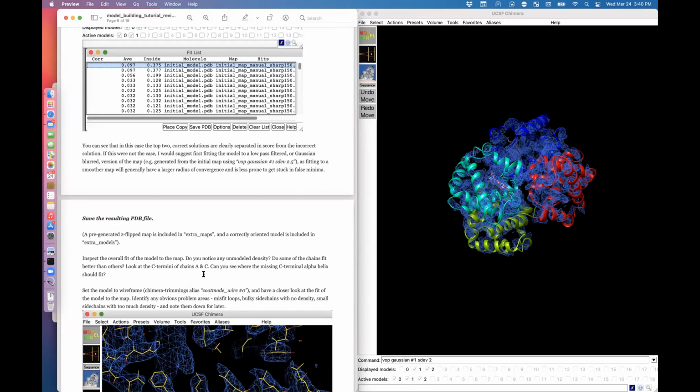What is the difference on using that command or using the option in tools in the volume? Oh, they're the same thing. It's sometimes convenient to be working on the command line because you can easily repeat commands, like, by cycling through the history. I just tend to lean towards using commands on the command line because they're just easier to reproduce. But absolutely, you can use a volume filter. That'll do the same thing.